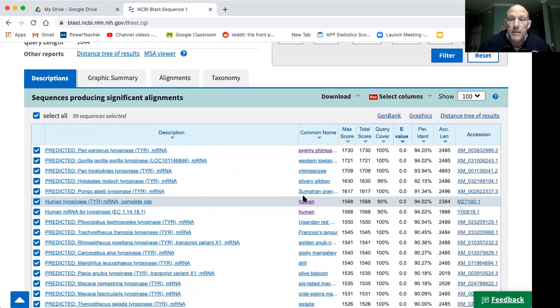And as you go further and further down on this gene list, what you're going to see is the frequency that the bases are exactly the same. Now, given time with evolution, these bases are going to change. So we expect to see, and we'll talk about a molecular clock later on, a lot of similarities with the bases, but with a few differences over time. As they mutate, given enough time, we're going to see more differences.